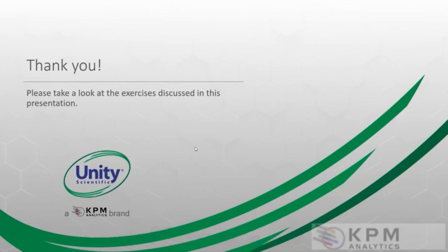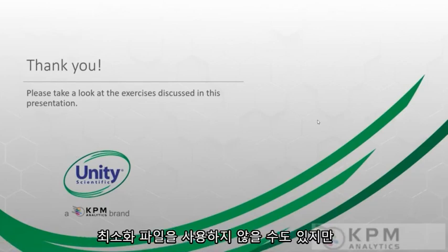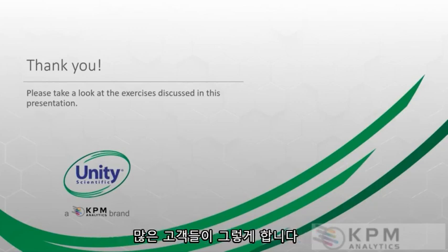Okay, and that brings us to the end of the advanced topics. I would encourage something I'd like everybody to be aware of. Your first calibration, you might not do a minimization file, but if you've got, again, this external variation that you need to make your system insensitive to, the minimization file can be incredibly efficient and do great things for you. We also talked about the way to do the external validation in Excel. A lot of our customers do that, especially those that are not that fluent in our calibration software. That's how they do their validations. Just keep those cautions and warnings in mind.